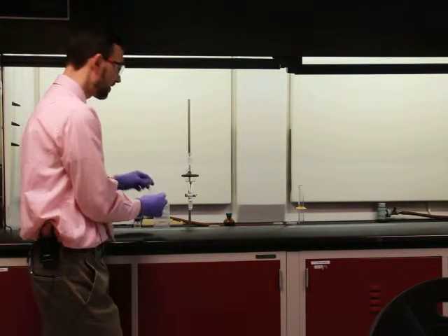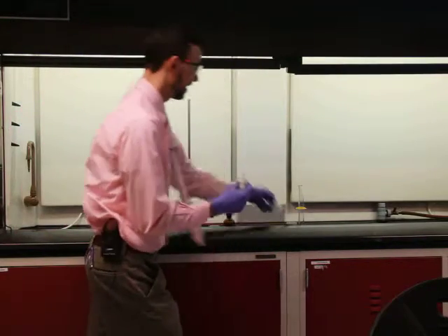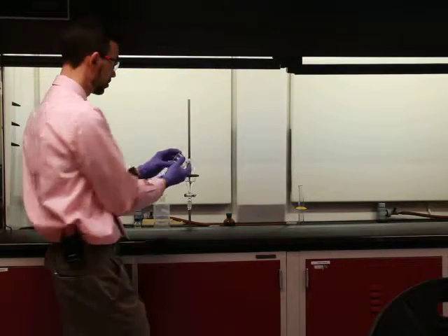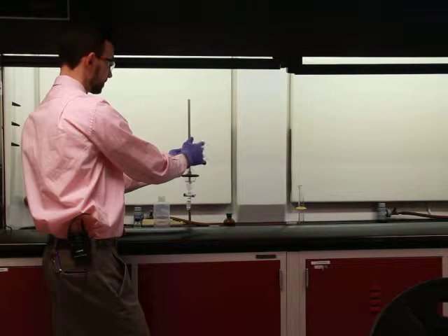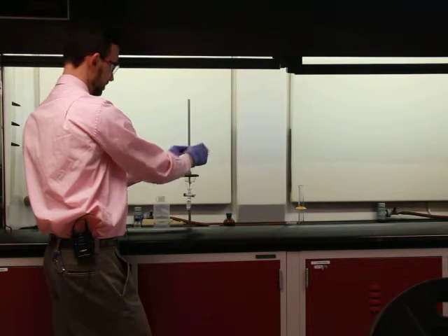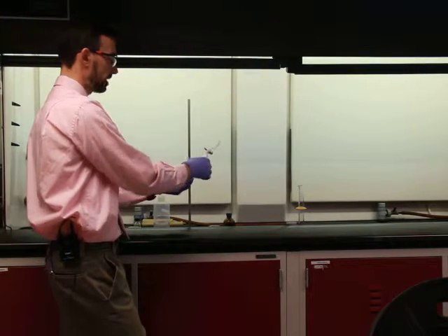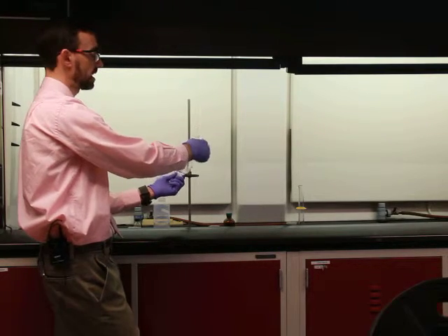So we would have weighed out a sample of this unknown. Forgive me for not actually accurately weighing it right now, but I'll show you what we'll do here. You would have gotten a small sample, not too much, and then it would have gone into the separatory funnel. Okay. And then with a little bit of shaking, that should have dissolved. Now the separatory funnel, the other thing is, listen carefully. Okay, didn't make it there.